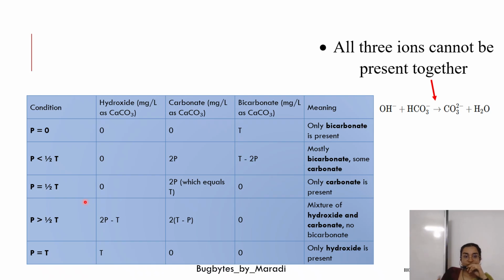So that is present. If you have a higher pH, above 10, like 11, 12, you will be mainly having hydroxide with some amount of carbonate. Dominantly, you will be having hydroxide ions. Bicarbonates are absent, because bicarbonate ions are mostly converted into carbonates. If the water sample contains it, bicarbonates react with the hydroxides to form the carbonate.